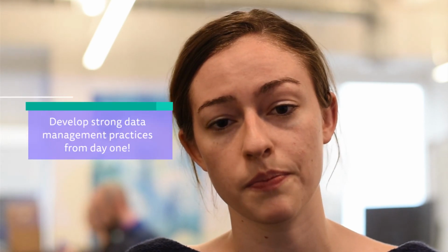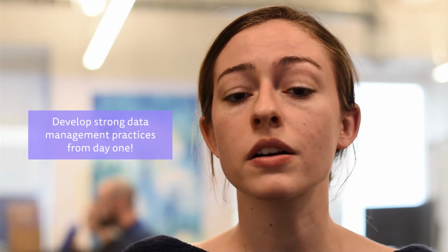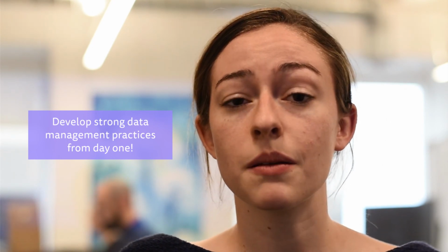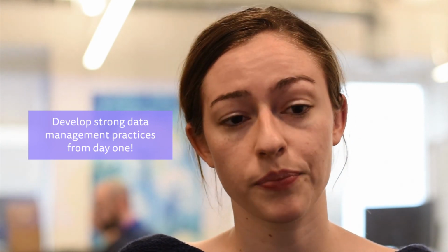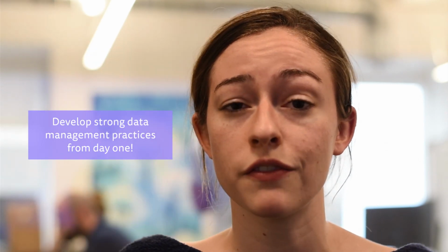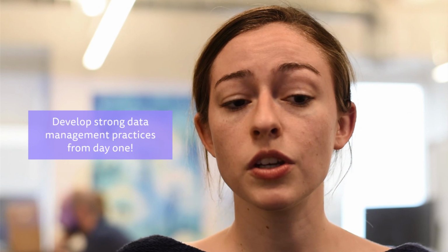We have experience growing companies from your stage, and we know that Witness and Review will prove especially important as your company grows. Getting started now with Witness and Review establishes strong data management practices from day one, preparing scientists and managers for successful report generation and IND filing. If you haven't already, make sure that you also watch our notebook training video to learn more about the specific features in the notebook that you can use to take your experimental notes to the next level.